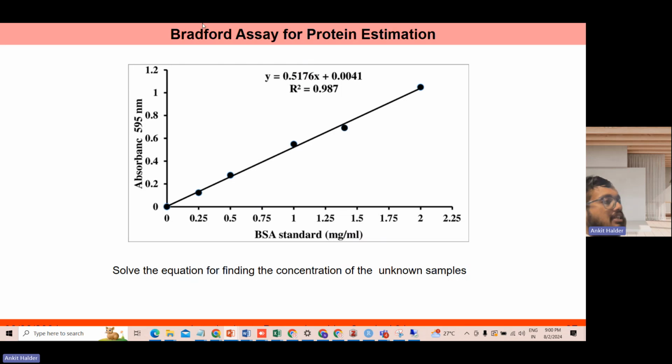Now again, in the standard curve, we will get this kind of particular standard curve. You can see, I don't know if you have observed or not, there's a difference in the concentration range that was chosen in BCA. A huge range of protein concentration is chosen, in a different range, not exactly in a linear range, to capture the concentration of the proteins.